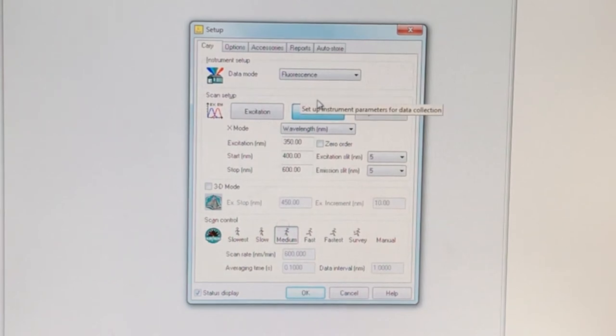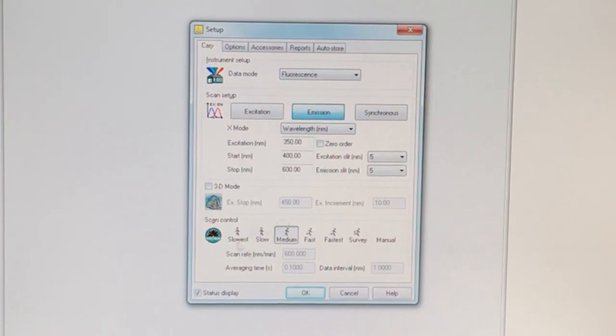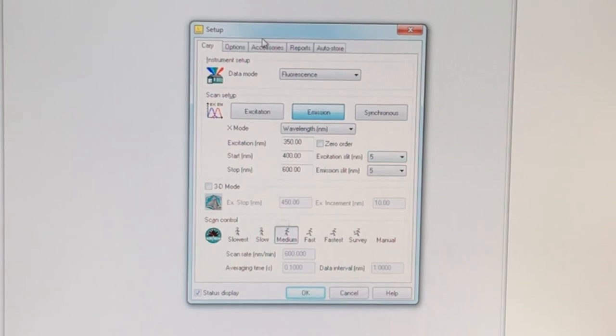If you need some really nice data for a research project, you may want to slow it down. If you just need some quick data, you can go fast.